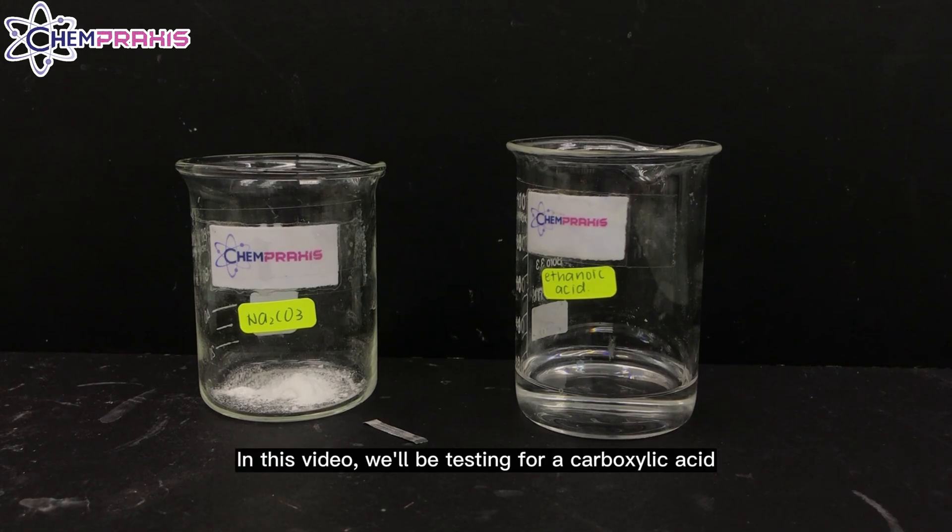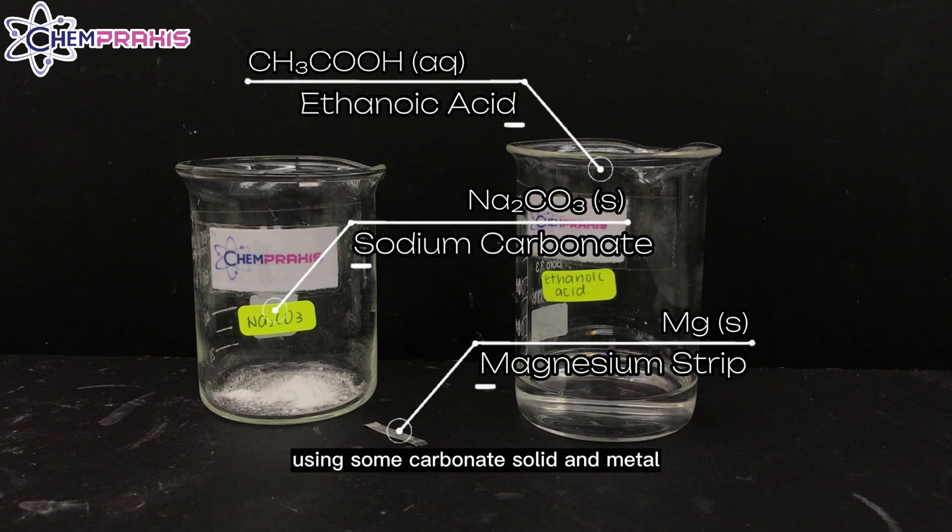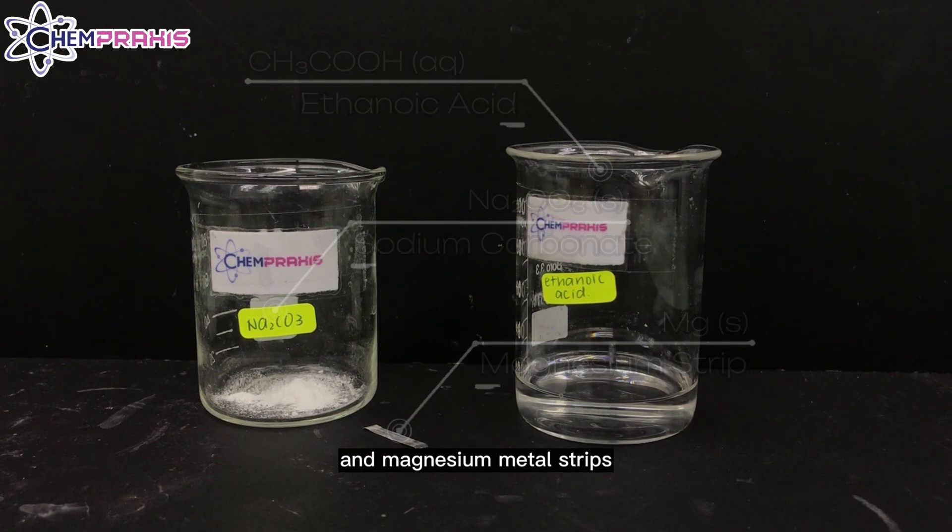Hello, we're from ChemPraxis. In this video, we'll be testing for a carboxylic acid using some carbonate solid and metal. Here, we have sodium carbonate and magnesium metal strips.